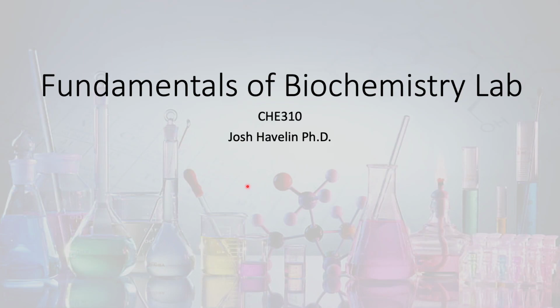Welcome back. So this is the pre-lab lecture for RT-PCR3. In this week's lab, we are going to be determining the concentration as well as the purity/integrity of our RNA samples that we've isolated in either the week previous or previously in lab.